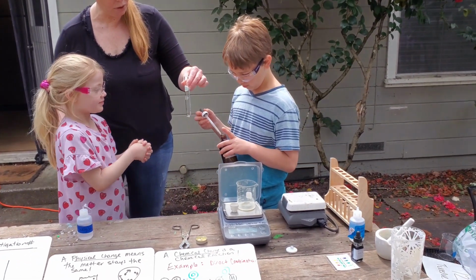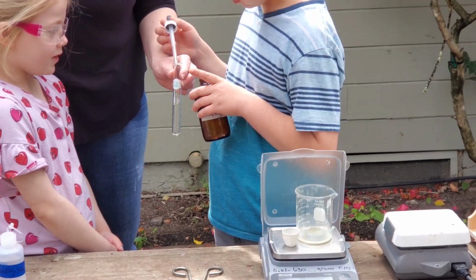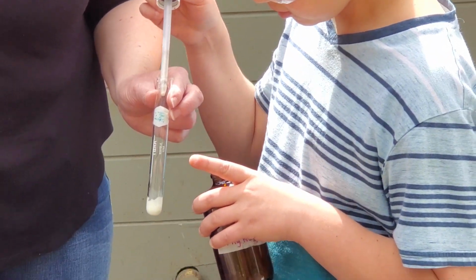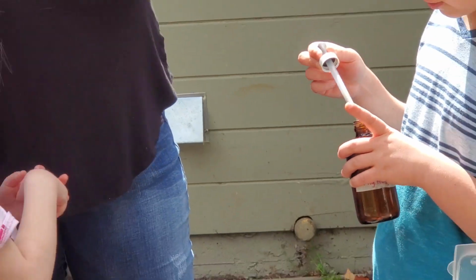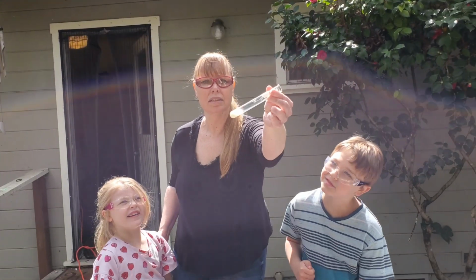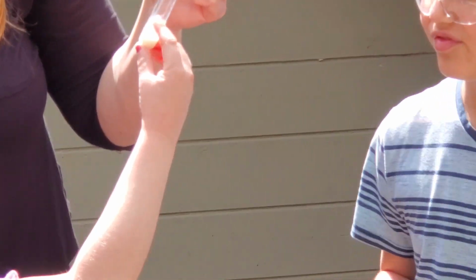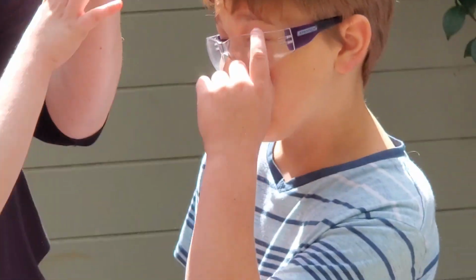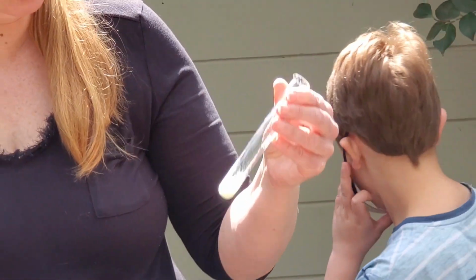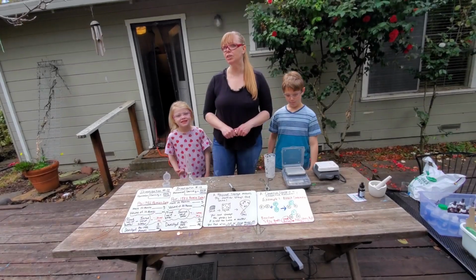Now Troy, go ahead and drip 10 drops in there. Are you getting that, Logan? Boom. Okay, we're good. What happened? It turned into a solid, right. And what color is it? It's a white solid inside of a clear liquid. Well, it looks white with maybe a tint of yellowish, I think. All right, number 11, guys. Physical or chemical?